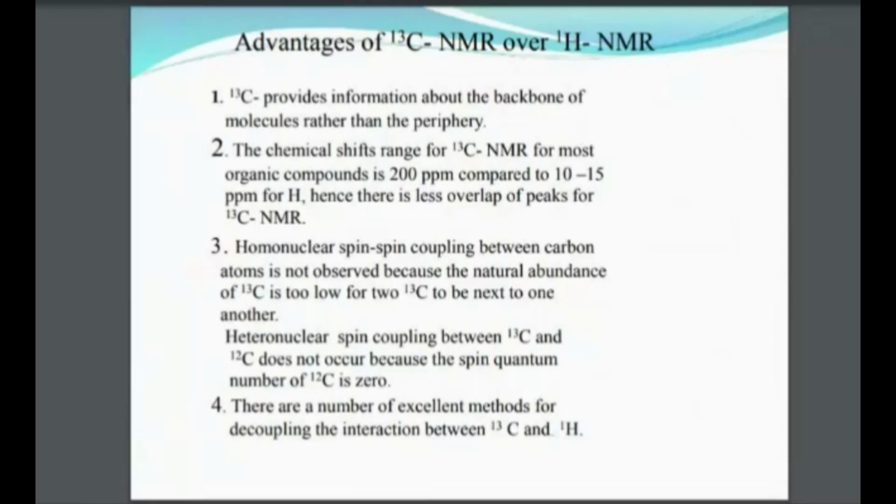See, imagine a carbon containing molecule. Try to imagine in your head that C13 nuclei are arranging themselves in the direction of the external magnetic field while they are precessing, while they are performing precessional motion. Along with them, H1 nuclei, proton nuclei, will also start performing precessional motion. I hope you can see in your head.